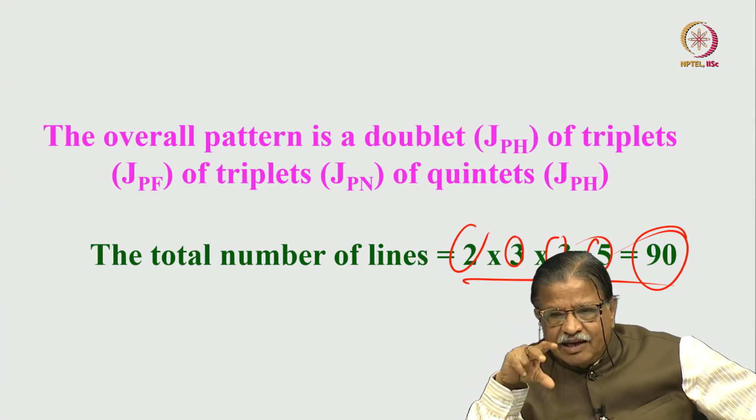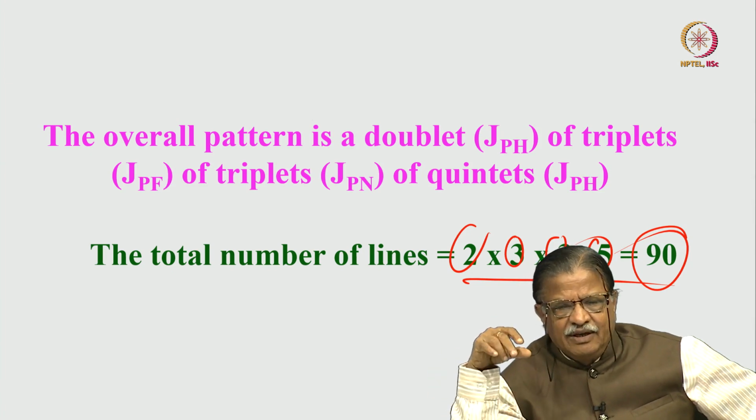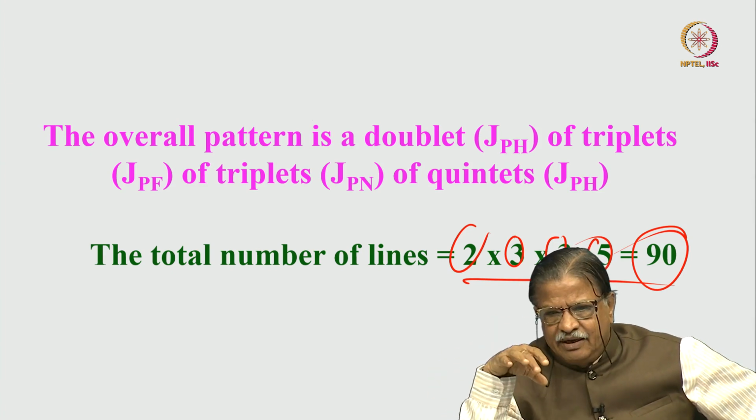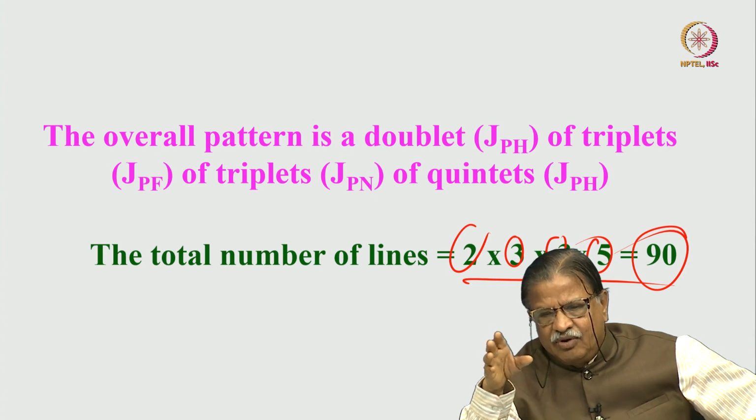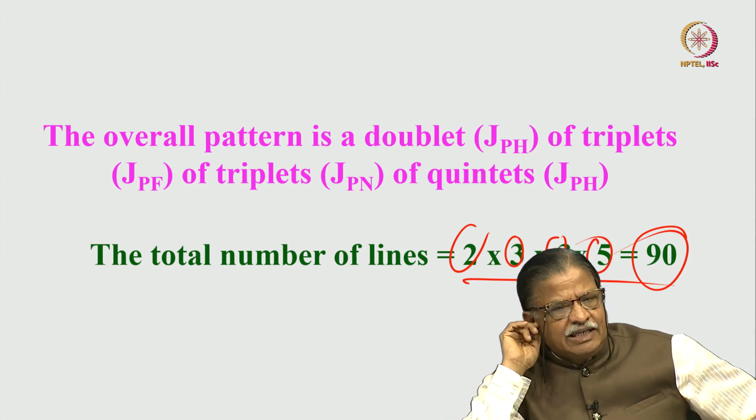And I showed you geminal coupling of FD is larger than cis than trans. So, this part we also observed that, and we measured the chemical shift also, how the chemical shifts are changing, the isotopic effect very easily we could see.